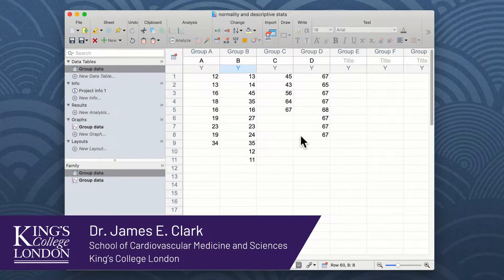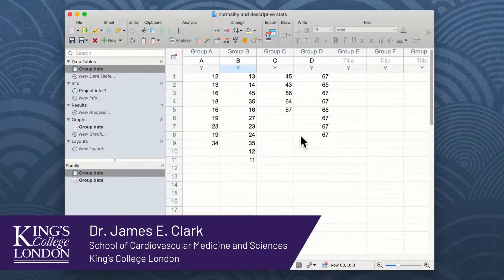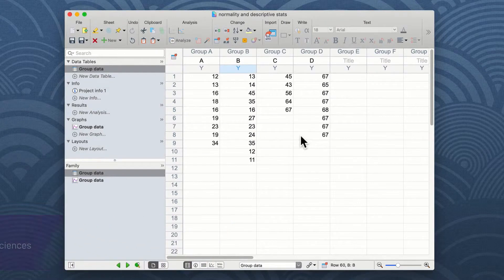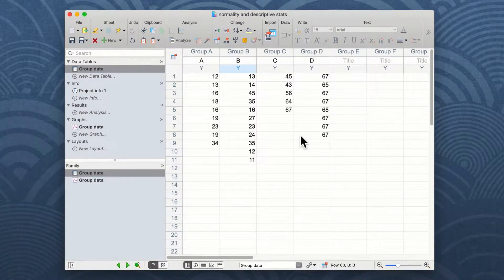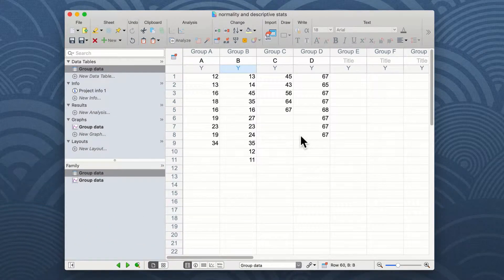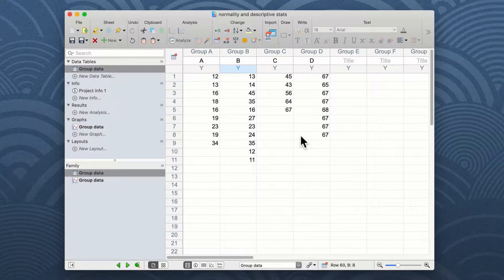Hello, my name is James Clark from King's College London. In this brief walkthrough, I'm going to look at ways of describing your data sets and also how to test for normality within your experimental data using GraphPad Prism.